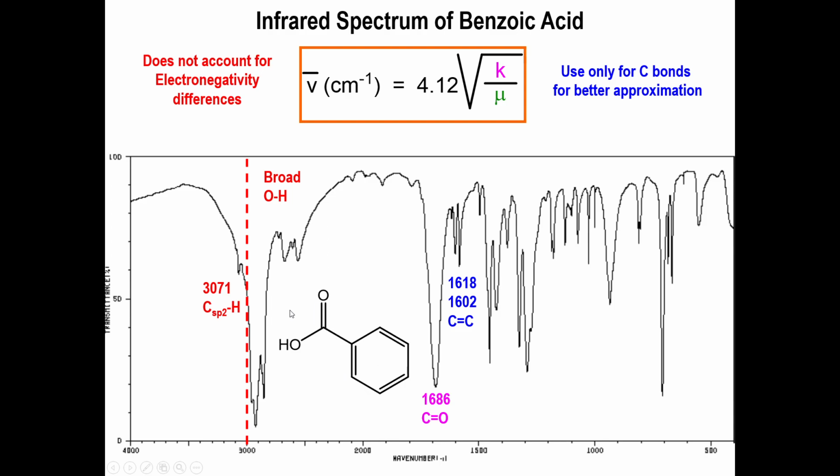Connections to aromatic rings are associated with values that drop down in the wave number signature, right? So your typical carboxylic acid falls in the low 1700s, but if the carboxylic acid is bound to an aromatic ring or an sp2 hybridized carbon, you see that the signal drops. In the case of the benzene ring, it drops down almost by a total of 100 inverse centimeter values, so we're now looking at something in the 1650, 1680 range.